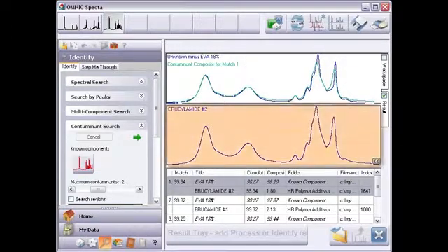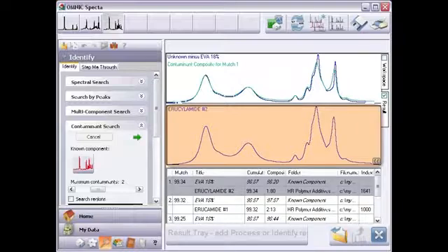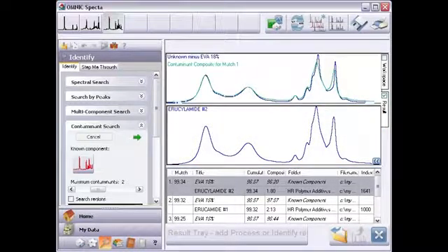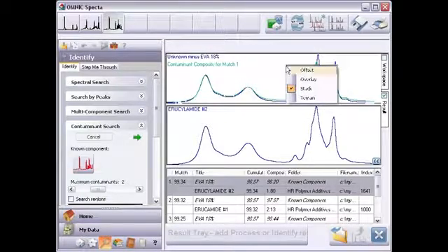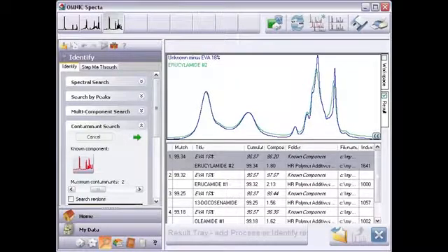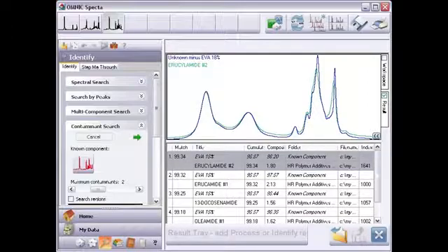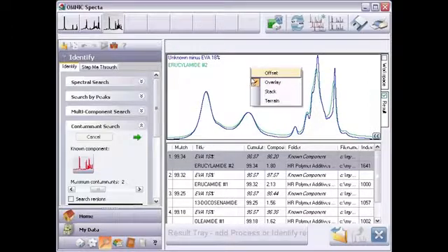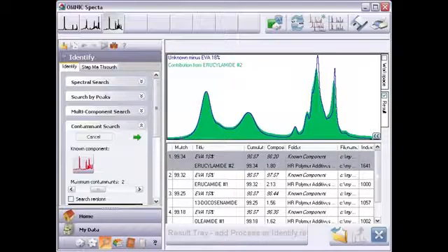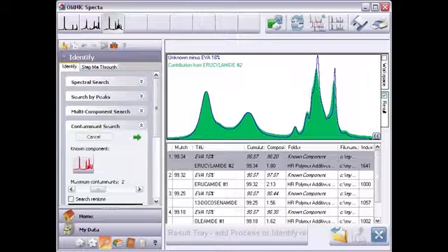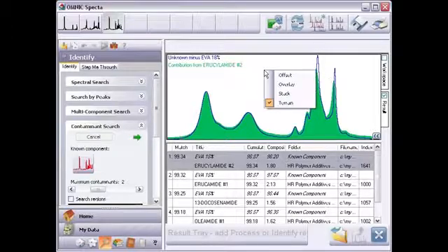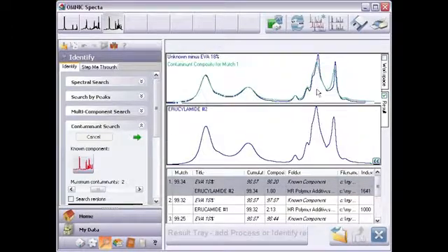This pane shows the spectra of all the found contaminants, one spectrum in our example. If you want to compare a found spectrum with what remains of the sample spectrum, right-click and choose Overlay. The composite spectrum disappears. Or you may prefer Terrain view, which shows the contribution of each found component to the composite and compares it with the remaining sample spectrum. This is the same view as with multicomponent search, except the sample spectrum does not include the known component. Choose Stack to go back to the previous view.